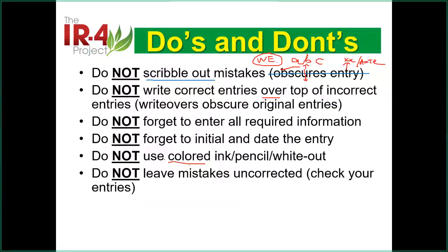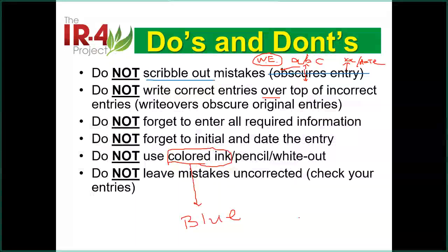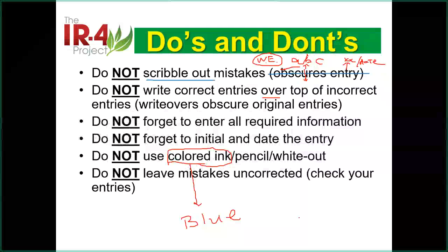So if you enter some data, in my lab, if you want to say this is original data, it should always be the blue color if you use a blue pen. Okay, so that's why nowadays a lot of pens, I will say 80%, are black ink. So we buy our pens intentionally, saying this is blue ink. Okay, and you can see the difference. Then you write it down. That's easy to tell this is original raw data or this is a copy.